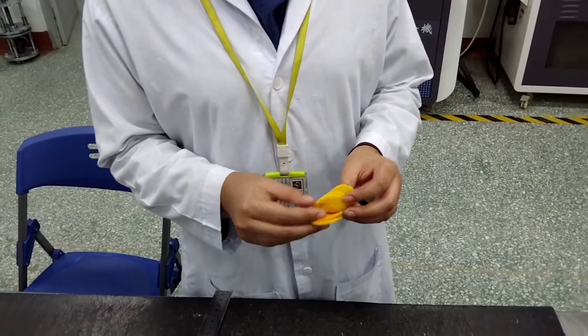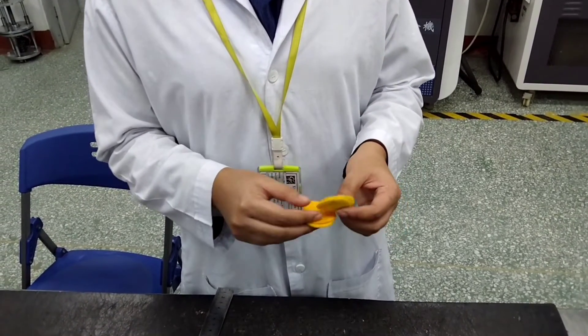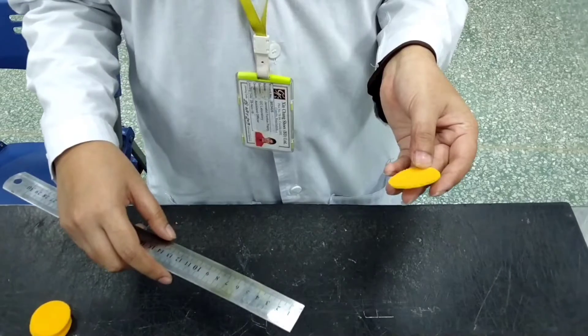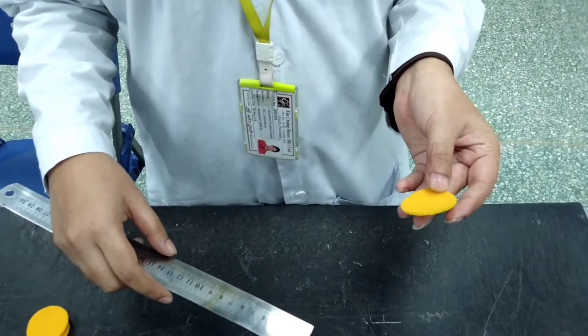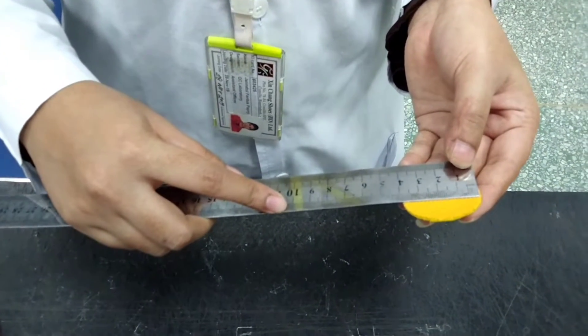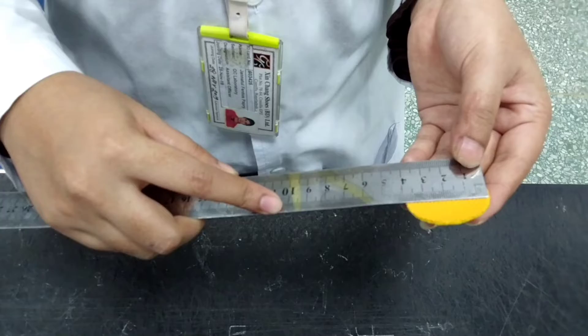I have cut 5-piece test specimen: 2-piece dry, 2-piece wet, and 1-piece sample. This material is lining. This material is 38 mm round.